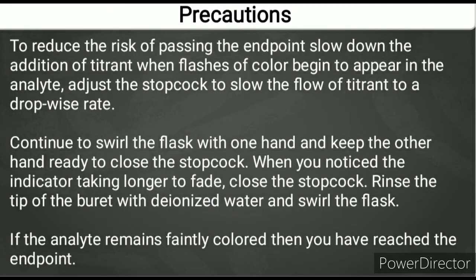To reduce the risk of passing the endpoint, slow down the addition of titrant. When flashes of color begin to appear in the analyte, adjust the stopcock to slow the flow of titrant to a dropwise rate.